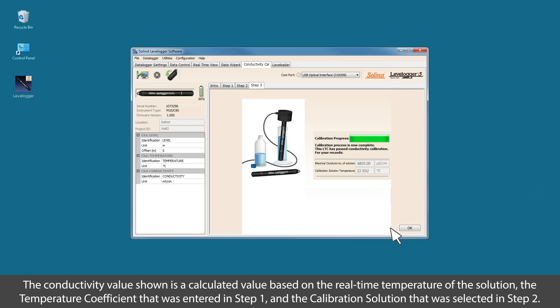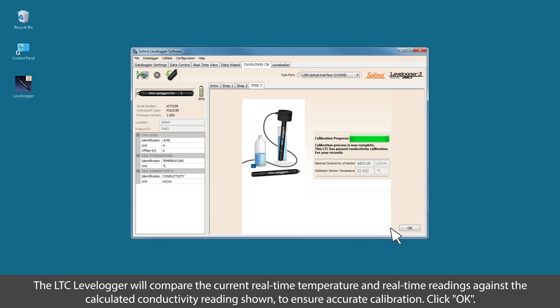The conductivity value is a calculated value based on the real-time temperature of the solution, the temperature coefficient that was entered in step one, and the calibration solution that was selected in step two. The LTC level logger will compare the current real-time temperature and real-time readings against the calculated conductivity reading shown to ensure accurate calibration.